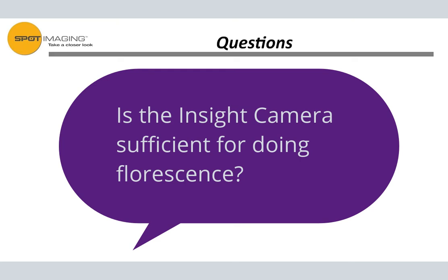The interesting thing about that sensor is that there were industry shootouts for OEM contracts, and Sony actually had multiple camera manufacturers introducing both the SCMOS camera and the previous generation CCD camera, which were the two benchmark sensors. And in nearly all the applications, the SCMOS cameras were winning the day.